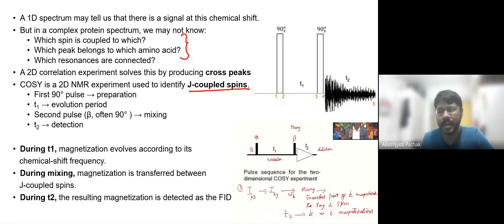You can see here, as it was explained in the lecture, you have a K spin, and this K spin is oriented in the Z direction. So initially it was IKZ. Now we have provided this 90-degree pulse, and now your K spin has been oriented to the Y axis. So now you have the magnetization on the Y axis, which is why it has been labeled as IKY.